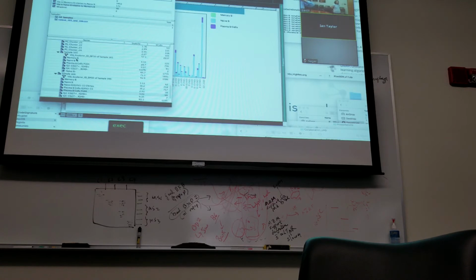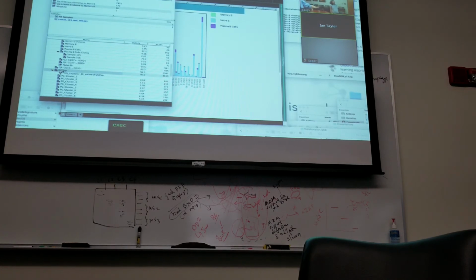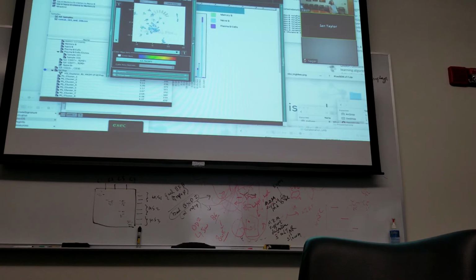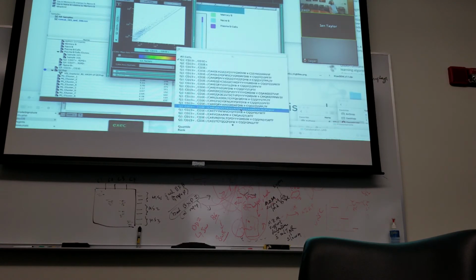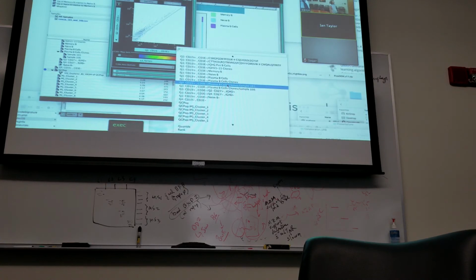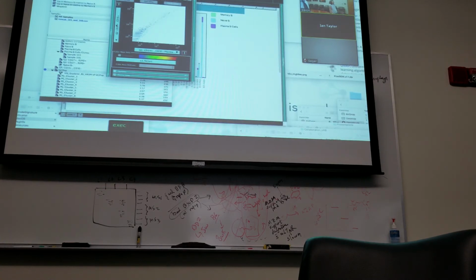Or is that what you're going to do now? What I was thinking to do is come back to this QC population, and then go back to the gene view and look at within each of the patients the different plasma cells. Exactly. Yes, let's do that. That would be wonderful. What's driving the plasmablast in 165 versus 166?